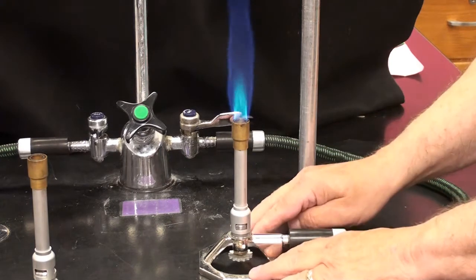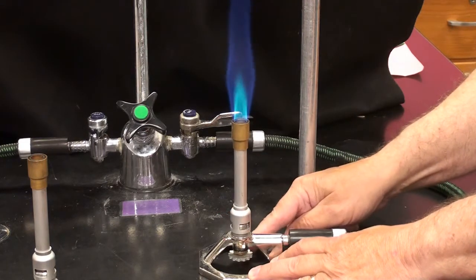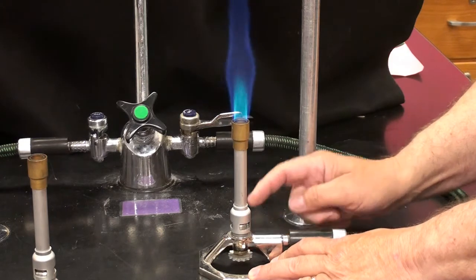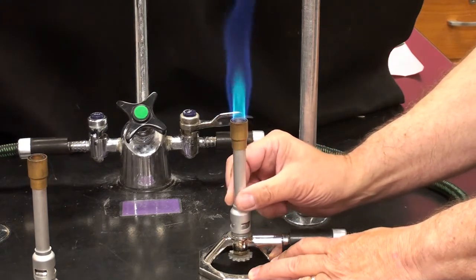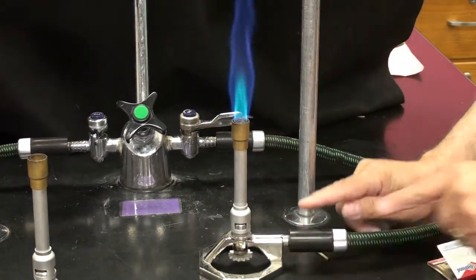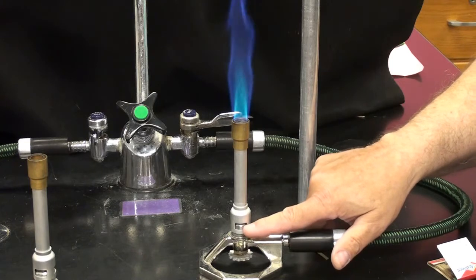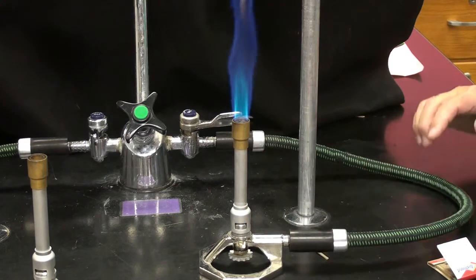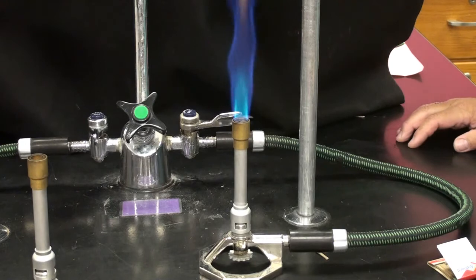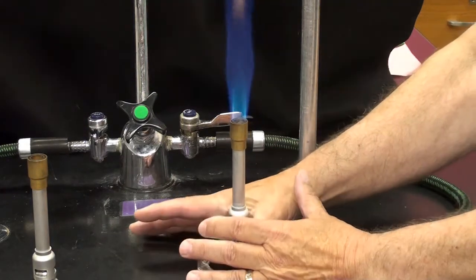And on these Bunsen burners, the way we adjust it is by turning the barrel. I'm not turning the valve below. I'm actually turning this barrel here. And when I do that, it'll open up a little tiny hole here at the base of the barrel and let in some air. I could actually plug up that hole with my hand. Let me do it right now. Look how the flame changes.